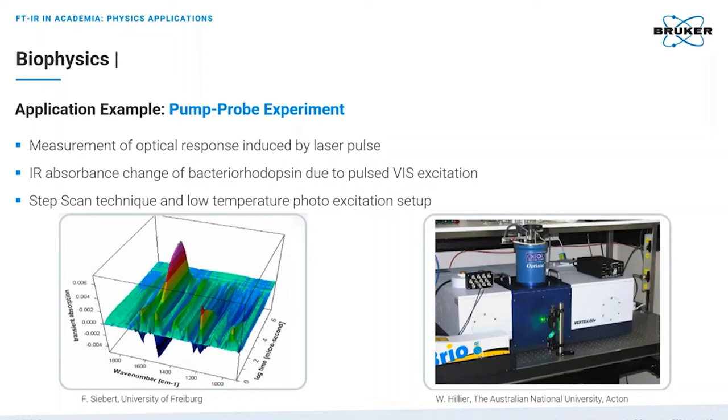Here in our experiment, out of biophysics, nanosecond temporal resolution is already sufficient. The sample will be excited by a pulsed laser in order to measure the change of the IR absorption due to the photo excitation in an FTIR spectrometer equipped with step scan. The visible laser is the pump beam and the IR source is the probe beam.